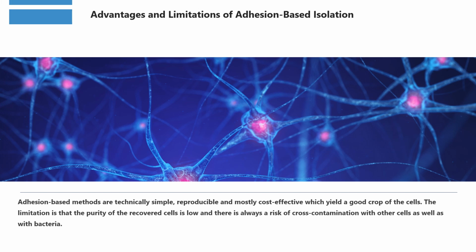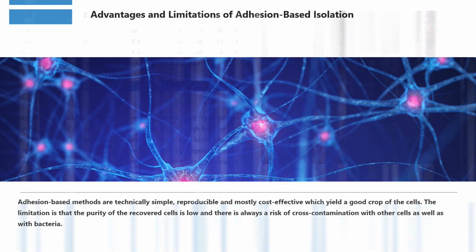Adhesion-based methods are technically simple, reproducible and mostly cost-effective, which yield a good crop of the cells. The limitation is that the purity of the recovered cells is low and there is always a risk of cross-contamination with other cells as well as with bacteria.